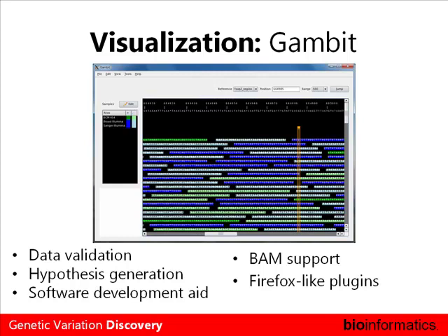So the idea is to make plugins that will help do analysis on these. For example, one of my colleagues in the lab does a lot of transcriptomics. So one of the plugins lets you look at your technical replicates and your biological replicates and produce graphs attached to them. And in that way, we hope to extend this more and more.